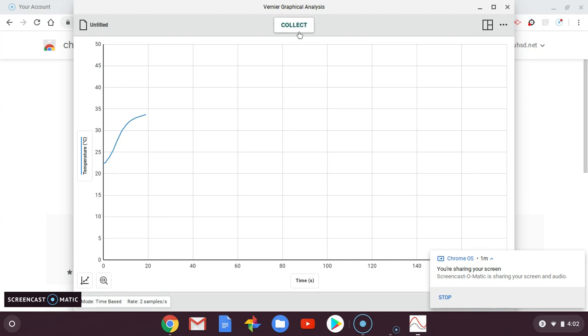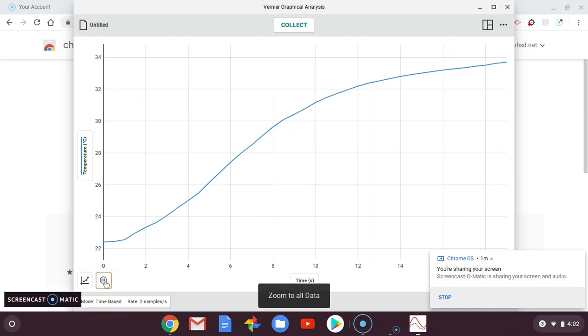A cool thing you can do is down here at this zoom to all data, you can zoom in so you can see your data more carefully. That's the picture you'll take and post in Google Classroom.